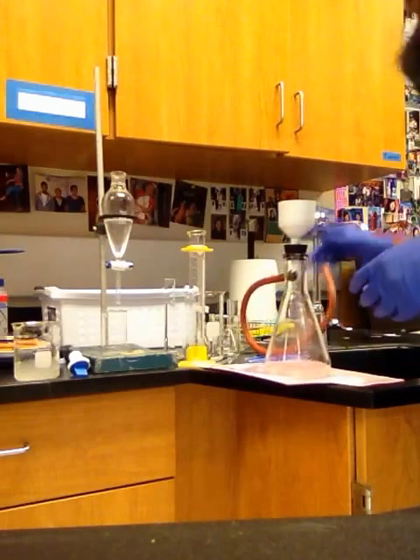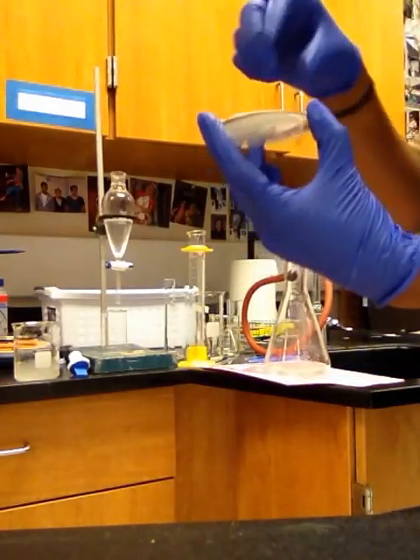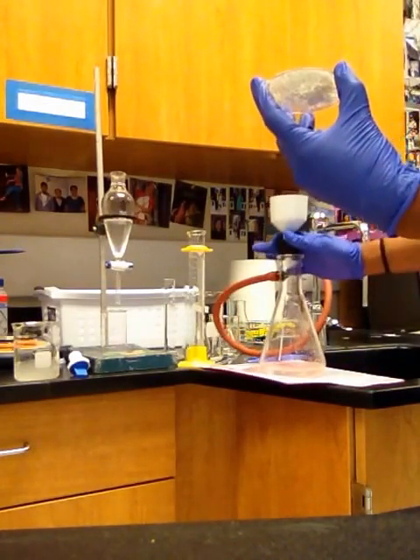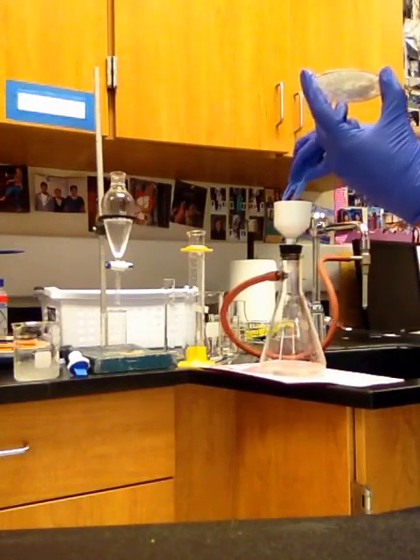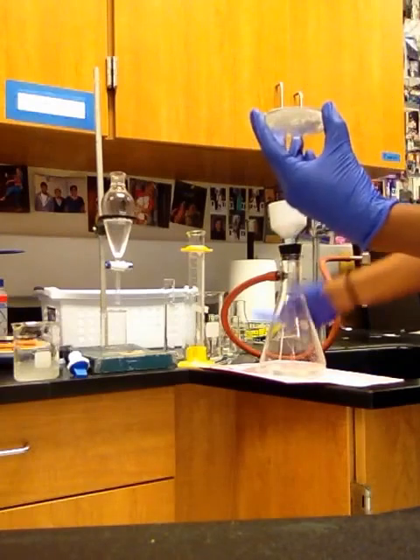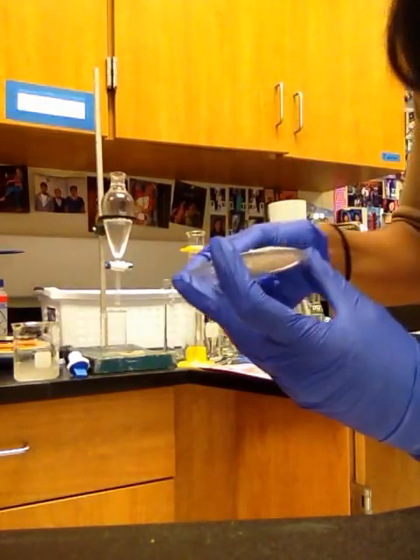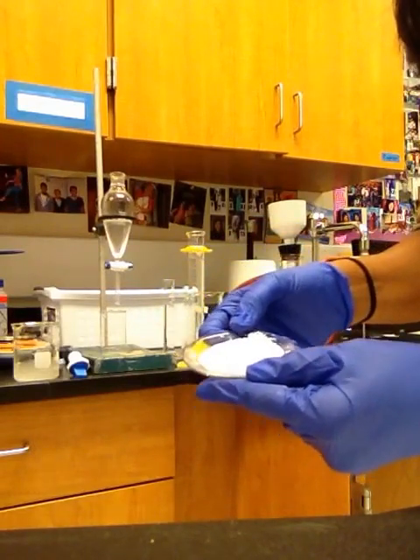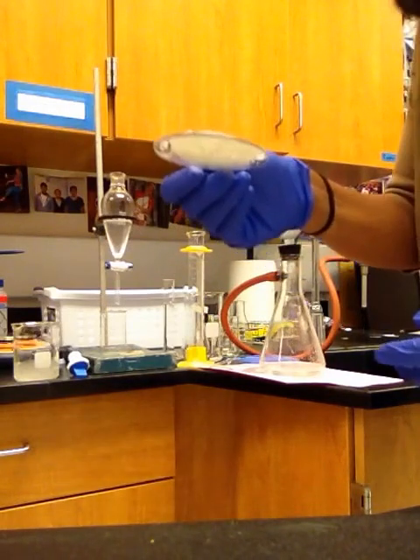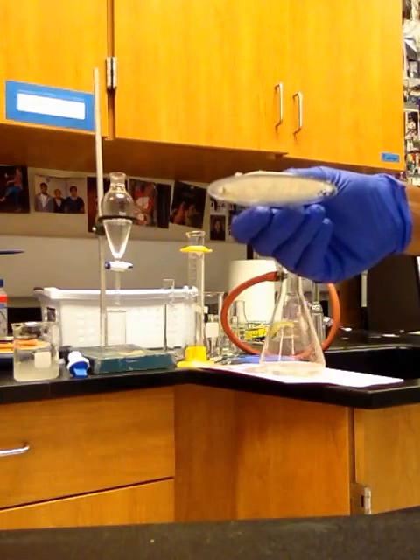Now on the pre-weighed watch glass, you flip this over and take this out. You might have to use forceps to loosen the filter paper, and when you tip the Buchner funnel over, it'll come onto the watch glass. So this is the watch glass with the binder and the filter paper. You will leave it to dry. Follow my instructions in class on how to leave it to dry for the next day, so then we can weigh it and get the mass of the binder.